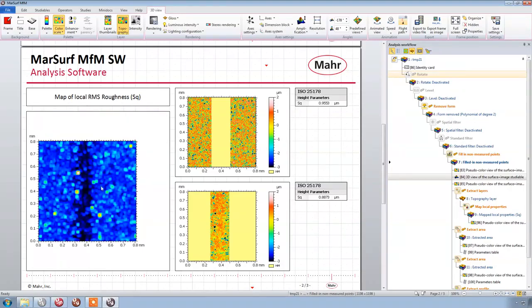So we can visualize that very nicely. Around the pencil lead, we do see a decrease in the roughness. We can also capture that in even more detail if we want to. So what I did here is I removed the penciled in area, the pencil line. I cut that out and I calculated the RMS areal roughness for that area, so SQ for that area.